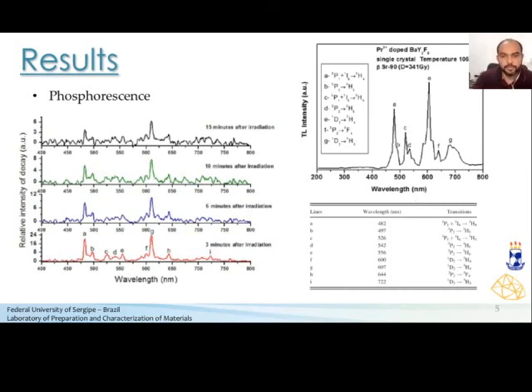As results, in this figure, we can observe the phosphorescence spectrum that decays slowly as a function of time. Note that it is the same spectrum observed in the TL measurement for the sample, which is also the same as the observed radioluminescence and photoluminescence spectrum. This means that the recombination and the luminescent center are the same.